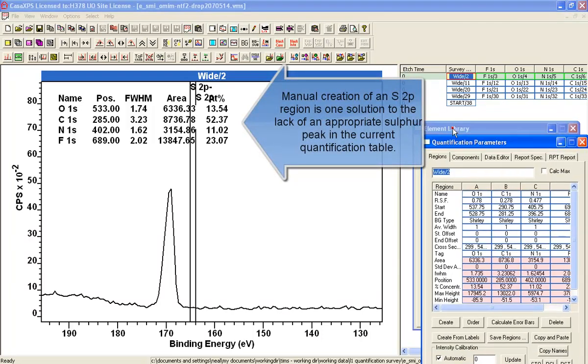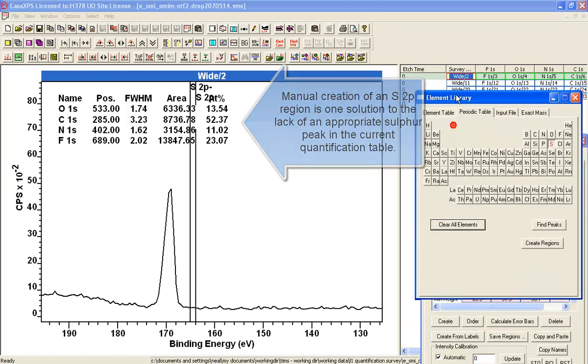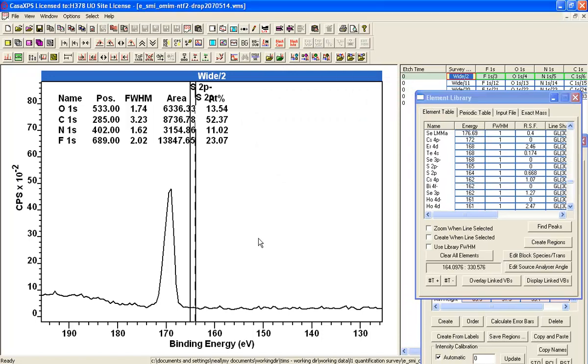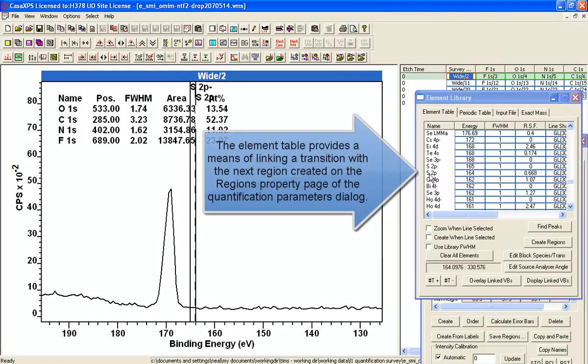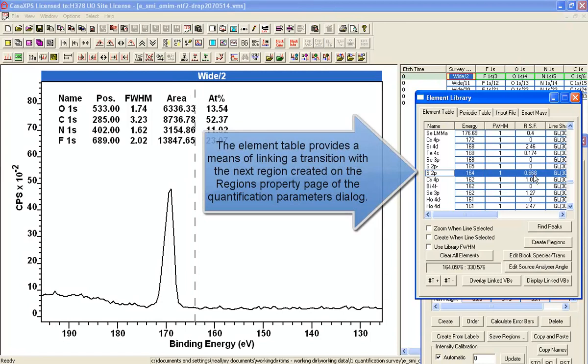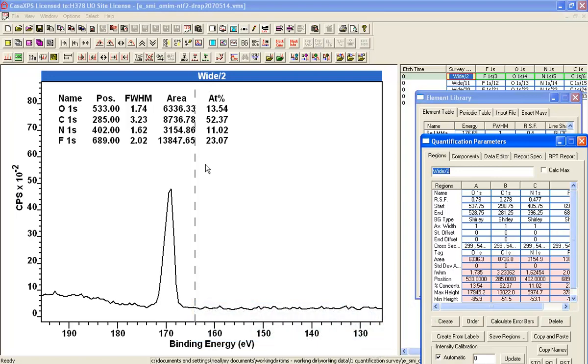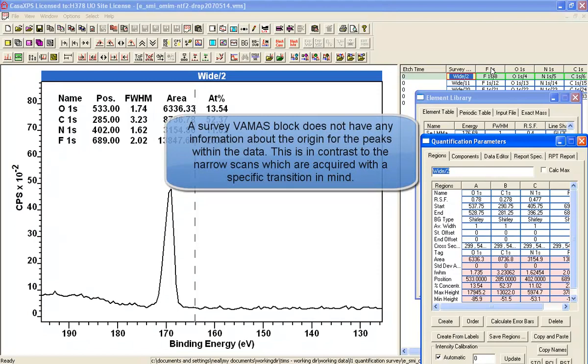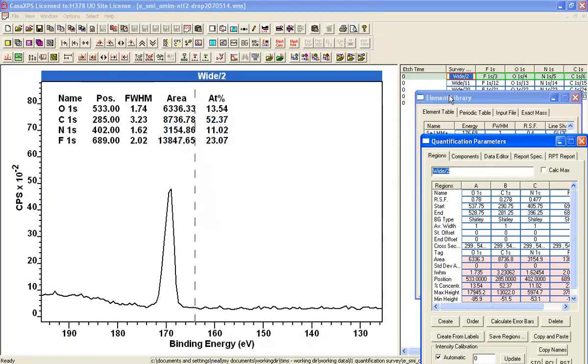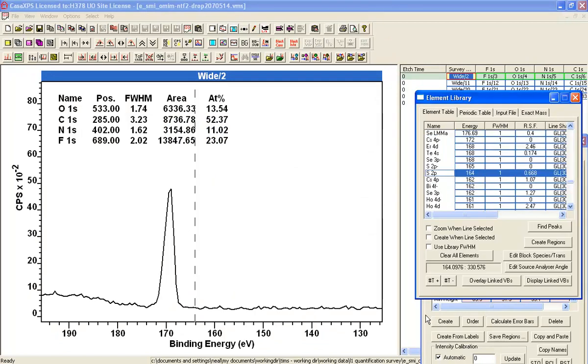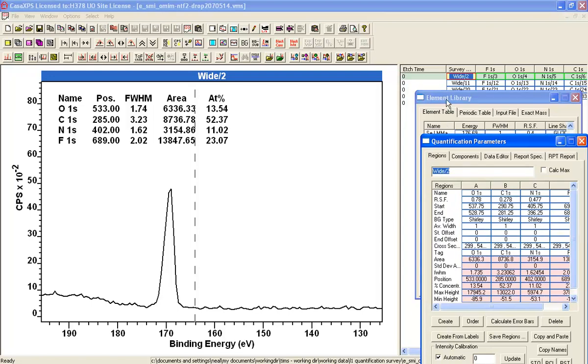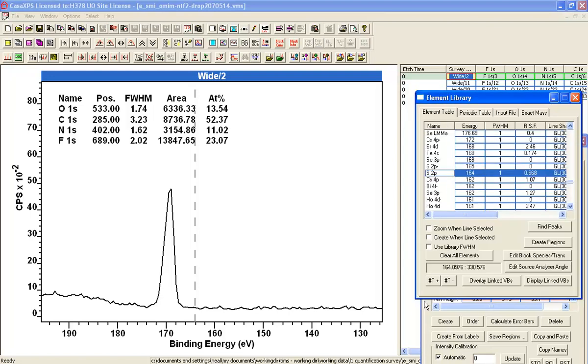And we can do this by manually entering using the element table an entry for the Sulphur. So if I select in the element library, you can see the relative sensitivity factor here. The reason that I have to select it is because the survey spectrum is in a VAMAS block that knows nothing about the actual elements that the data represents. Unlike some of these narrow scans, this is supposed to be fluorine. This survey doesn't have the same context information. So in order to create a region here, I have to indicate the element. And I have done with this Sulphur 2P. And then I can say create, having indicated on the element table, create.